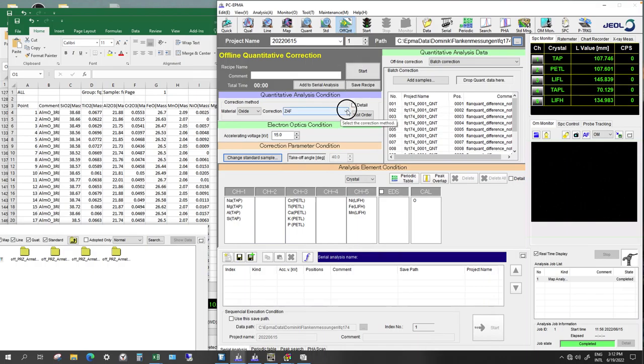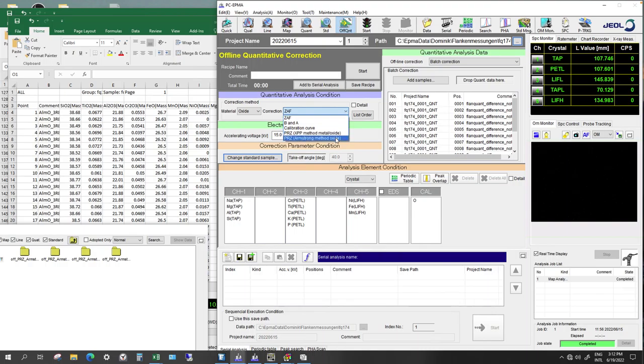So actually I always use Armstrong units. So it changes to Armstrong. So I think that is better.